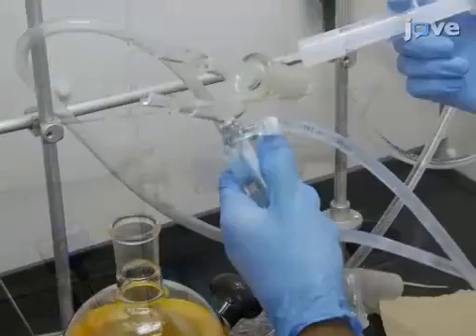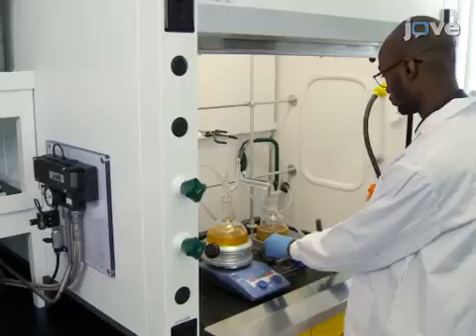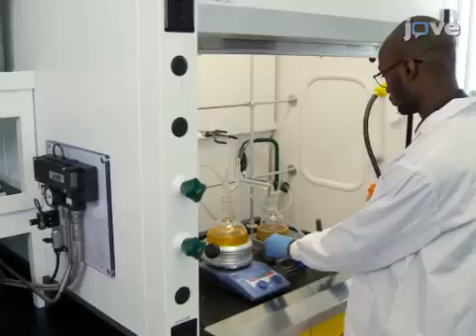Next, remove the condenser from the round bottom flask. Replace it with a simple distillation setup connected to a condenser circulating cold water. Place the reaction setup under vacuum and set the pressure to 1 mmHg.